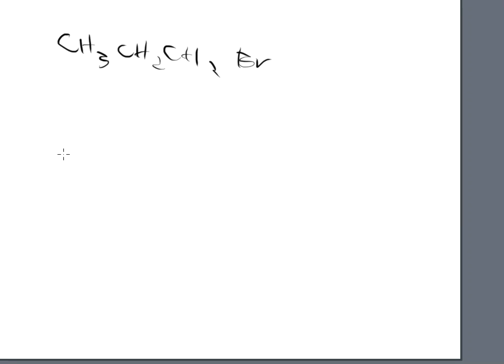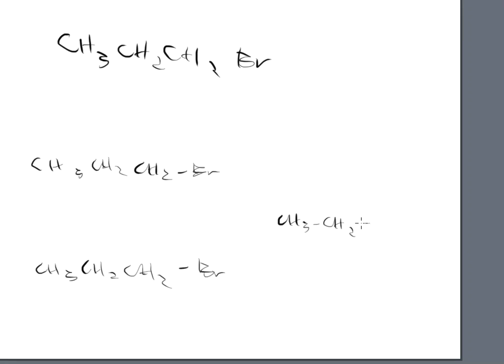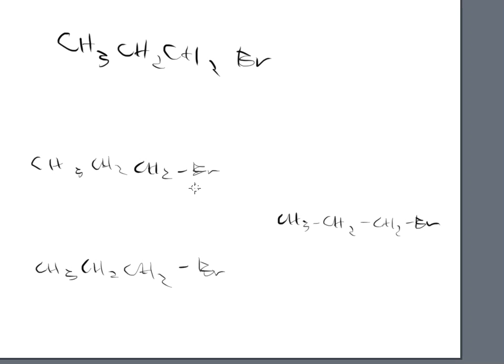So again, if this is bothering you, I would take the extra time until you really get it in gear, folks, to just draw the different versions of the structure and go through and start naming these. And if you get a different name, then you're going to end up with a different signal. So in the first example, I'm taking that hydrogen and replacing that with, I don't know, something. Let's just put an OH group there. I don't care what it is. Just put a group there. And then in the second one, I'm going to put the same group here.